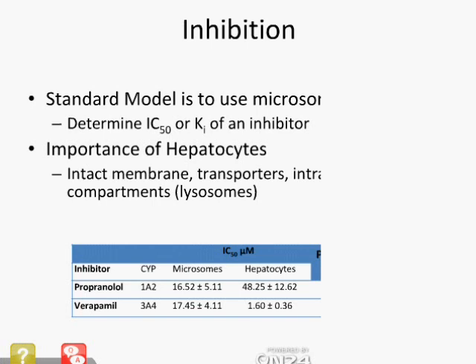As observed in recent publications, there is a growing focus on vetting the use of hepatocytes to predict inhibition and to explain the mechanisms involved.